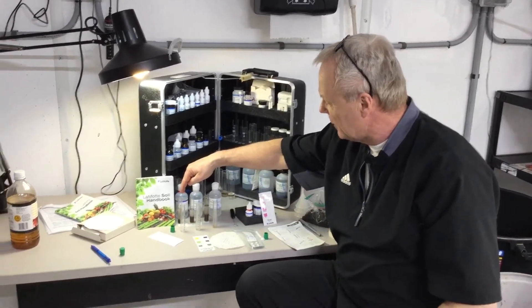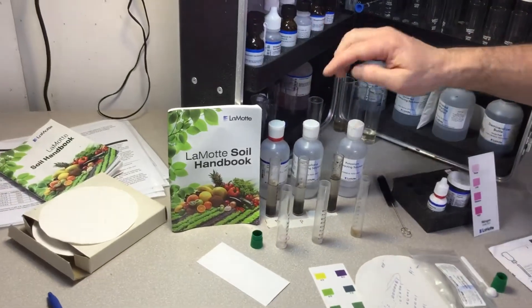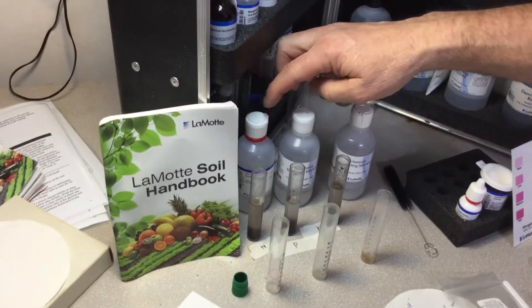In the back row here you see the three test tubes. I put a piece of tape down so I don't get them mixed up. And then behind that I have their extracting solution.